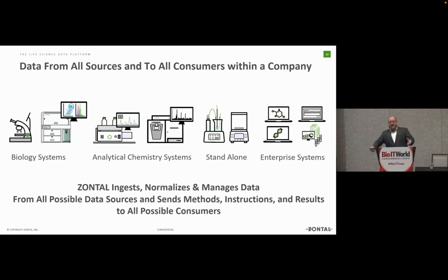So you can go across all of your NMR spectra that were produced and are in the system and see, okay, with which instrument were they produced over time, in which labs, which software was used to analyze them, things like that. Questions that you can now answer with this.